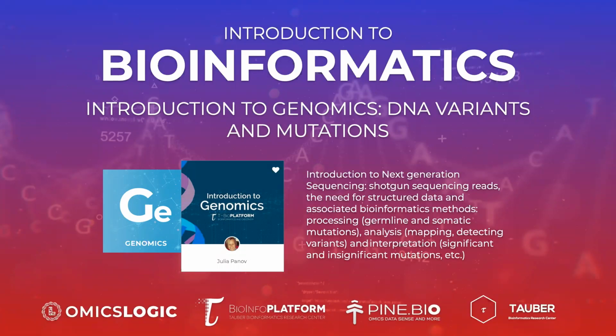We'll try to go over the shotgun sequencing challenges with mapping of short reads, the need for structuring data so that it is useful for downstream analysis, different types of variation, and different types of locations for those variants that are important for interpretation.